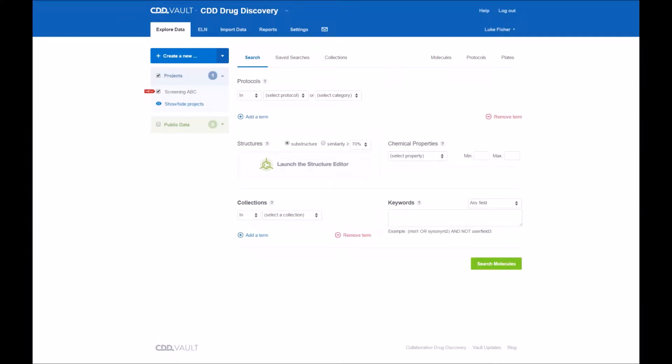Hello everyone and thank you for viewing this video. The topic on this video will be how to import data using the import data wizard within CDD Vault.